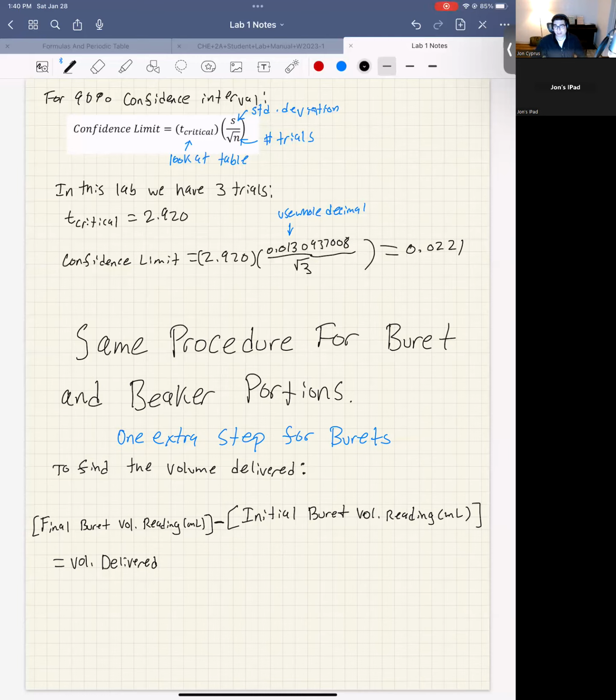So that's with the burettes. Again, don't fill it up to exactly 12. I think the easiest example to give is that burettes are kind of backwards from what you're used to. Typically you fill up a graduated cylinder to like 10 milliliters and then you pour it in, and then it's all in there. But with a burette, you're actually draining out volume from the burette.